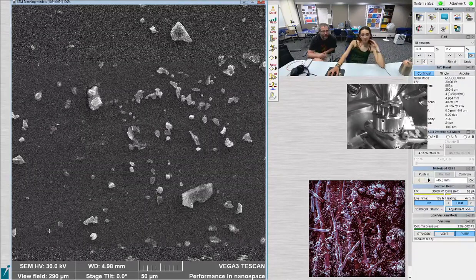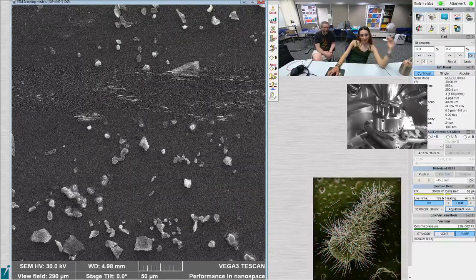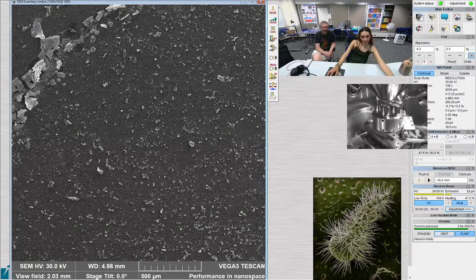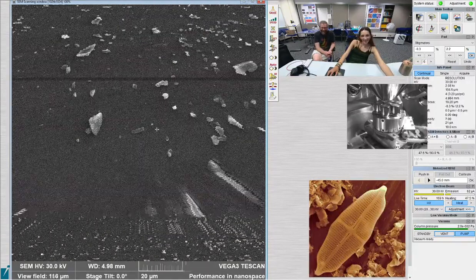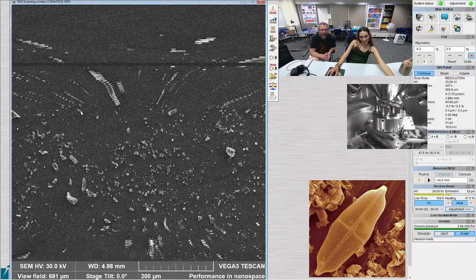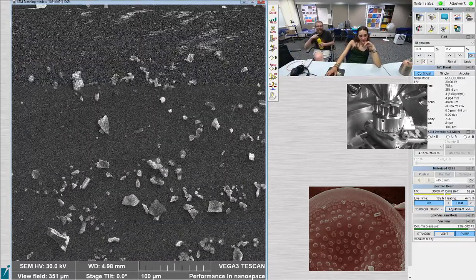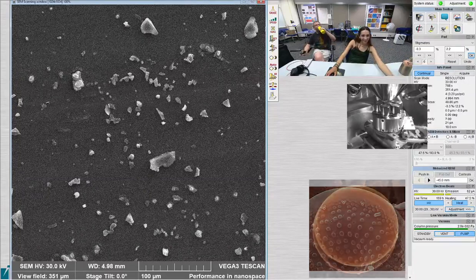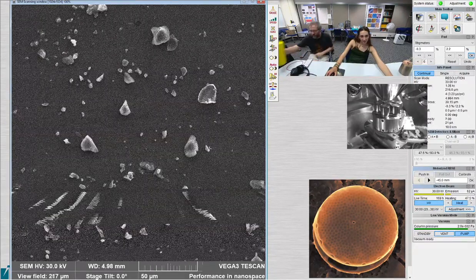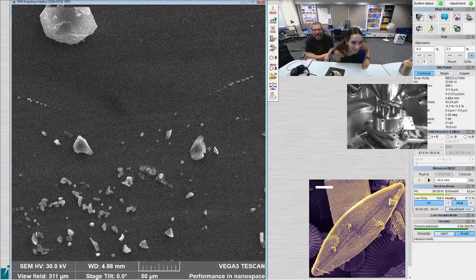This one? It's gone now. I'll get it back. This one? Yeah, maybe Eunotia? I don't know. Or it could just be a piece of junk. We'll find out when you zoom in instead of out. I do that a lot. It's a piece of junk anyway. It's fine. Sometimes it's confusing which way is in and which way is out. Not very intuitive. It's not as easy as righty tighty, lefty loosey. The wheels on the microscope do not go round and round. Well, probably not.